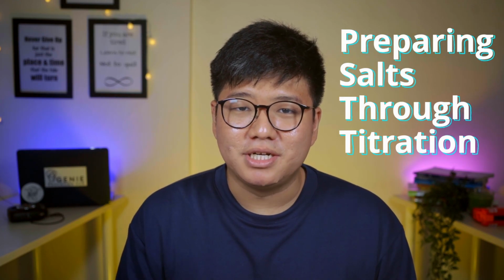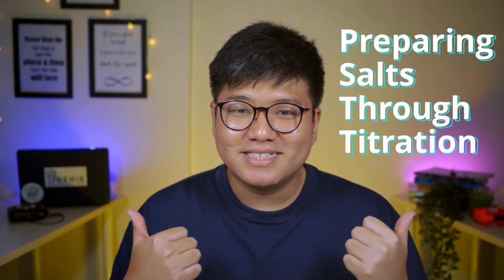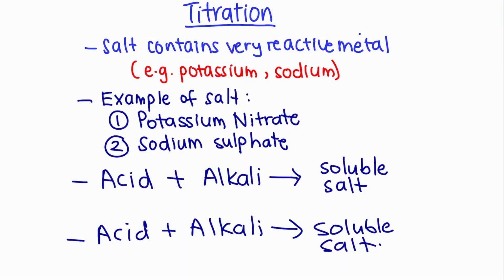Today, we will be going through how to prepare soluble salts through titration. So, let's go! Students generally guess what starting reagent to use when preparing salts. But that's not the way. So when do you know when you need to use titration?